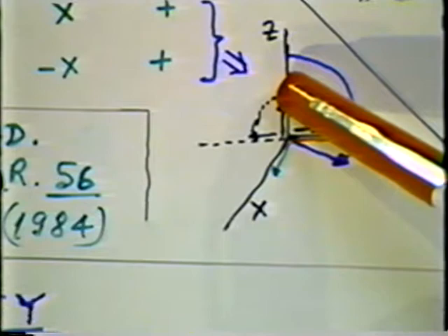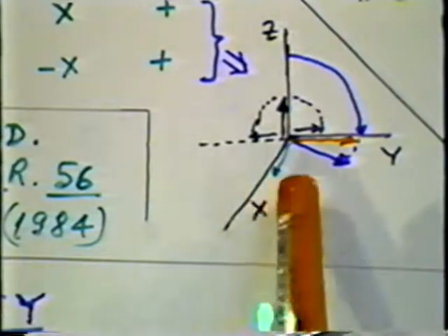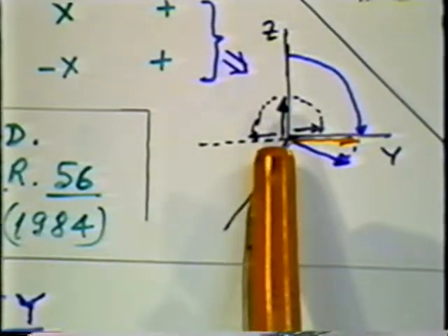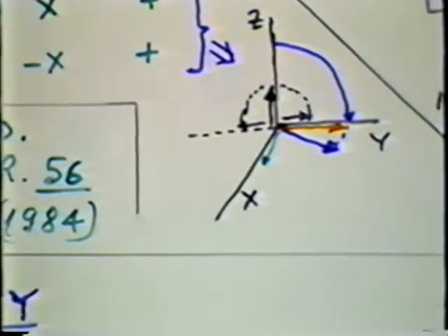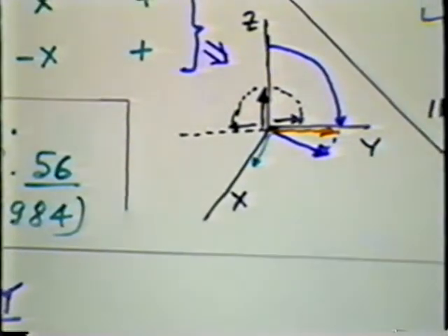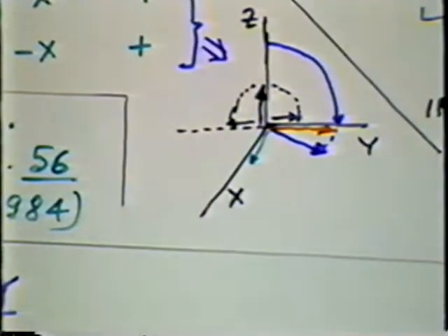Then I apply the second pulse along the x-axis, and I get this component. If I repeat this experiment with a minus x second pulse and add the two, as you see, my information about these components doesn't change, but this black part, that is the axial magnetization, is cancelled.